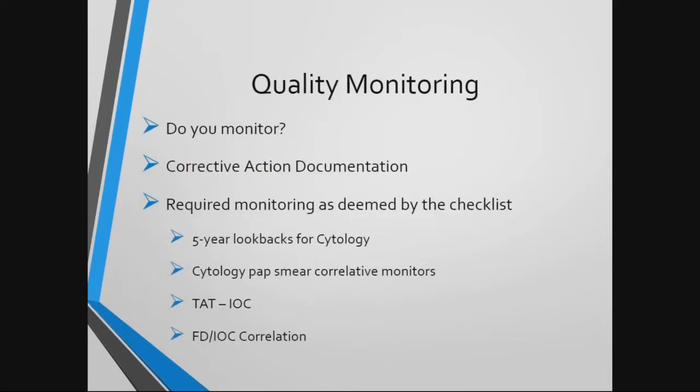Quality monitoring is very important, as we all know, for every department and will always be a topic of discussion during inspection. All departments are required to have monitors established, and histology and cytology is absolutely no exception. Not only should quality monitors be demonstrated, but more importantly, corrective action must be shown when monitors fall below threshold.